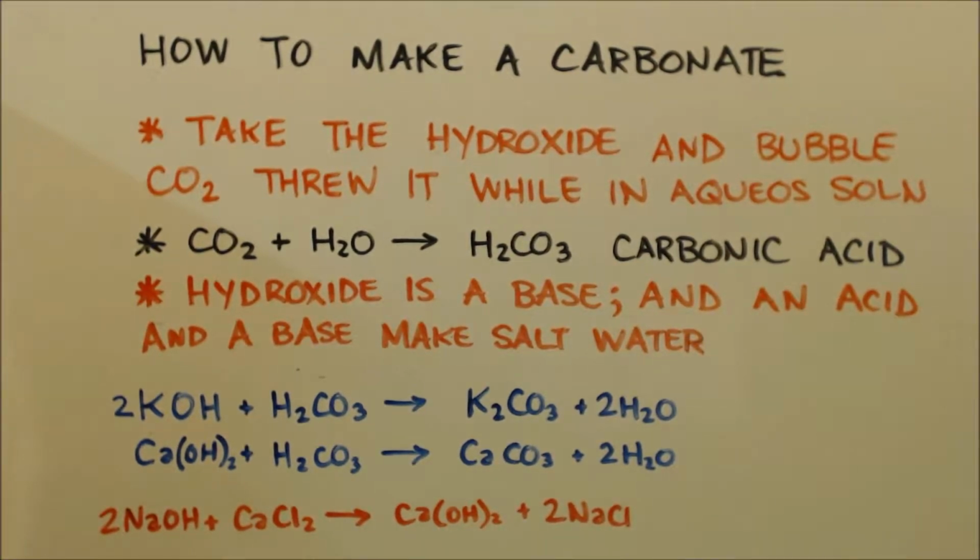Now what I do, because I actually buy potassium hydroxide that's already in water, when I buy it, I put it in a tray and I want to recrystallize it because it's soluble in water. But I don't like to do it fast. I just basically put it in a glass pan and throw it on my radiator, my heater in my house.